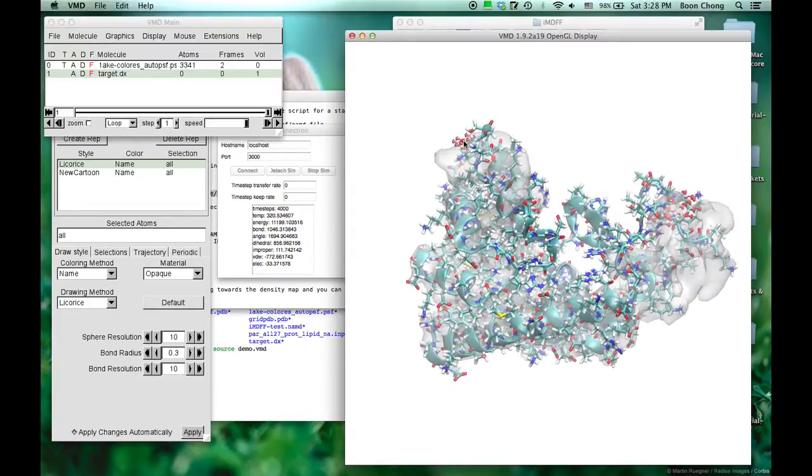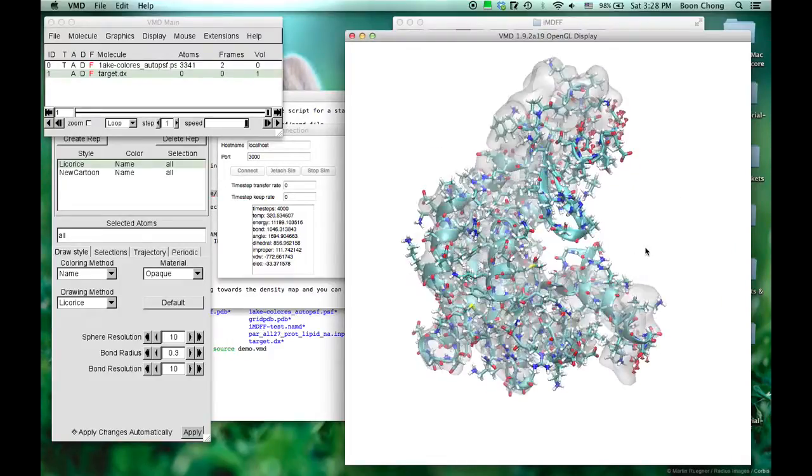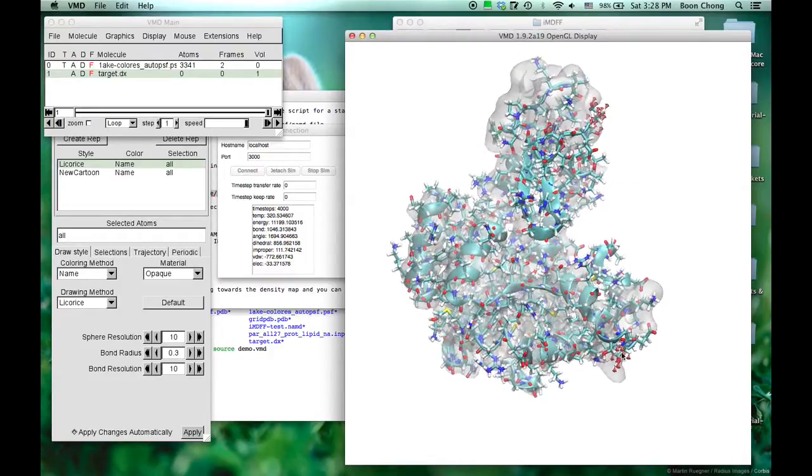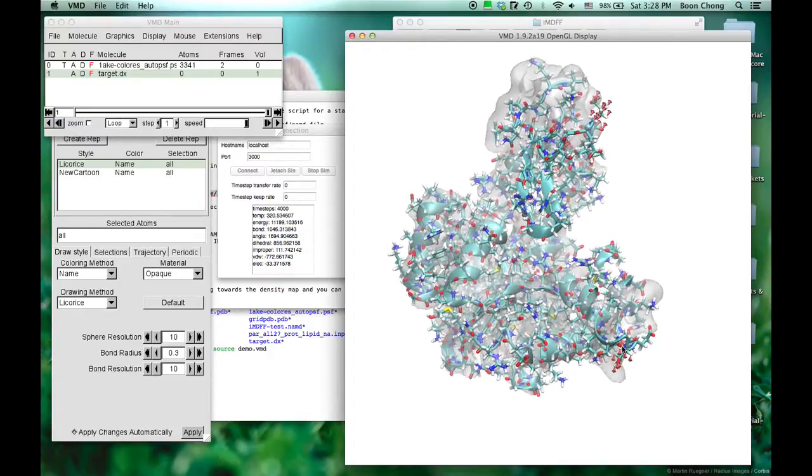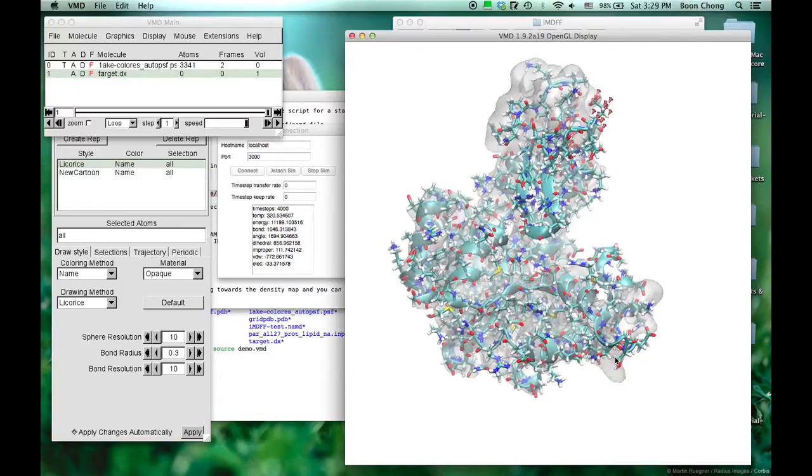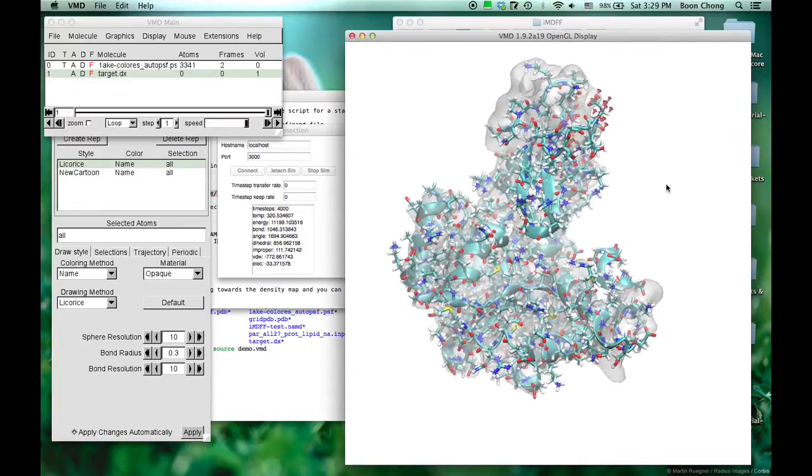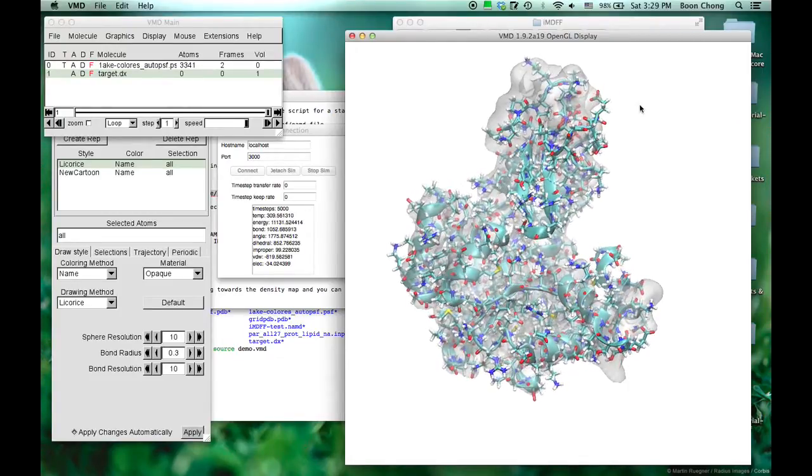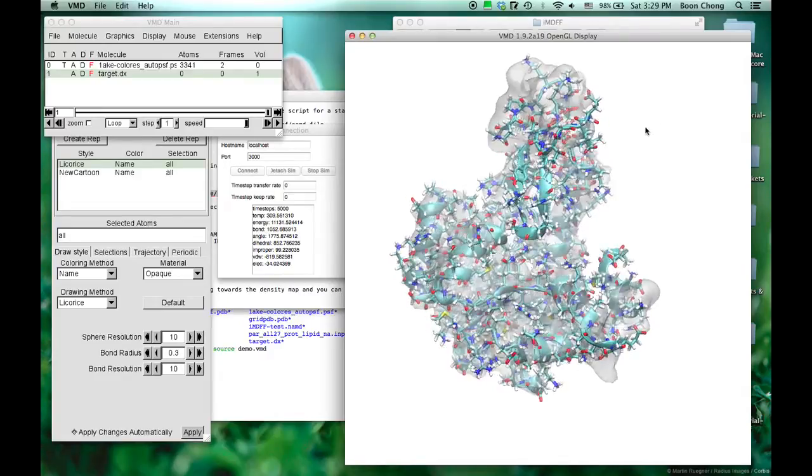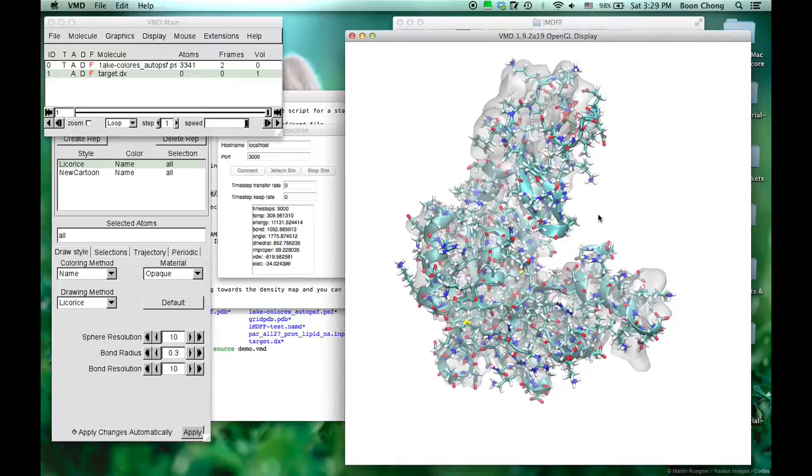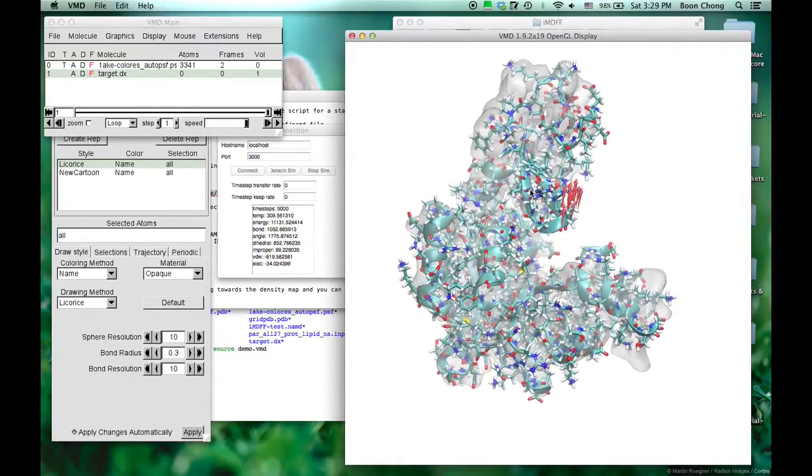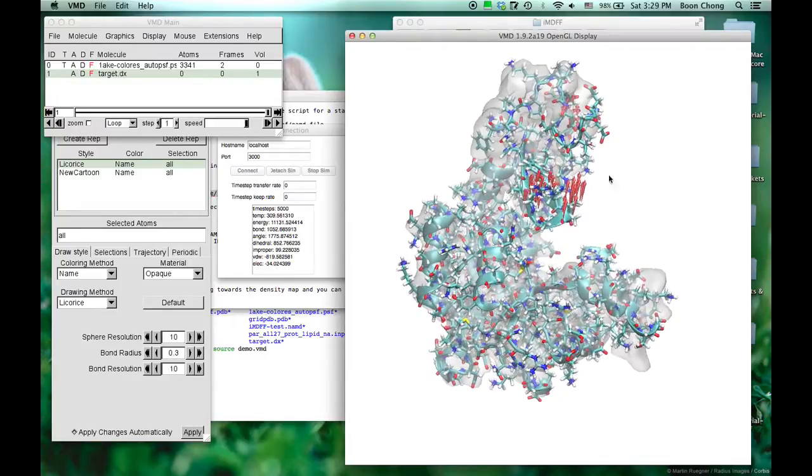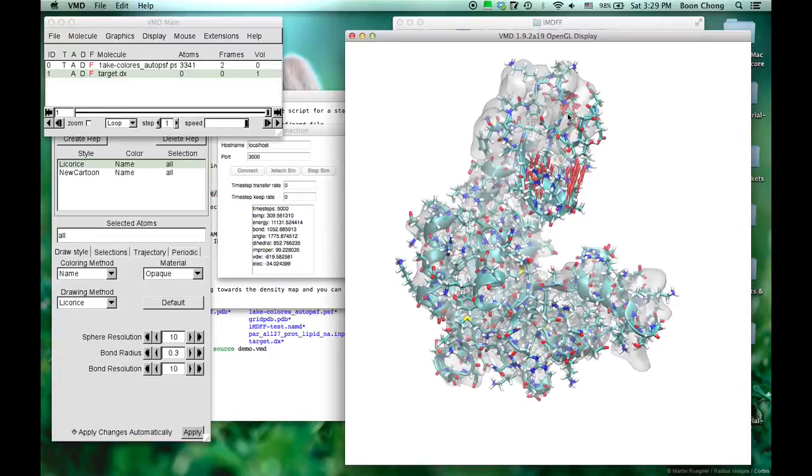Stop the force by double clicking it. All the forces are gone. You can see that it's much different from previously. We want to move it in quickly.